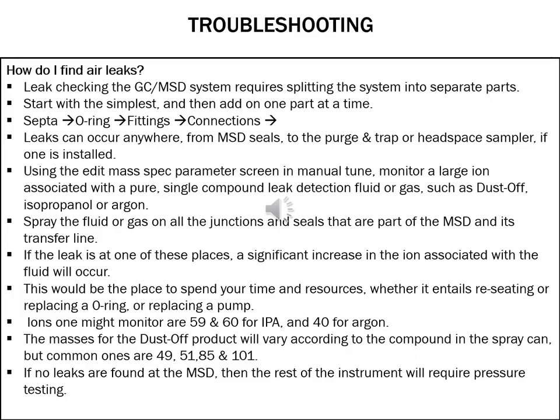And then you find that the air leak is gone. Or check the O-ring that's sitting on the liner inside the injector. Maybe that O-ring needs to be replaced, and then also check the fittings and all the connections. So that's where you start.